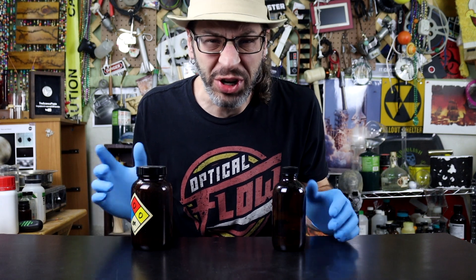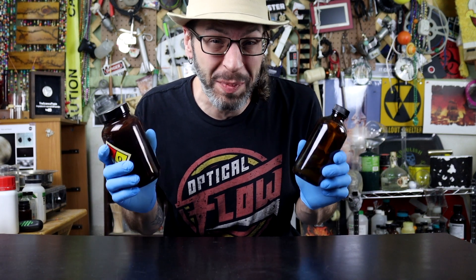Today we're investigating Newton's third law. We're going to use the power of peroxide and permanganate for propulsion.